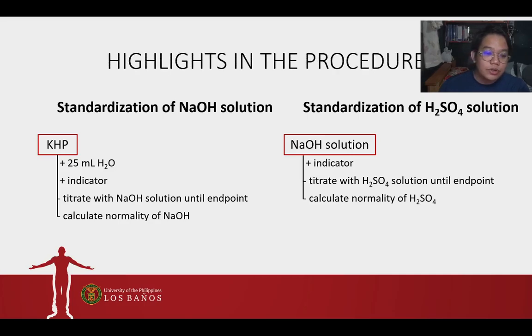So for the procedure, first we have to standardize our sodium hydroxide solution by using potassium acid phthalate as primary standard. Okay? So medyo alam nyo naman na tong steps na to from your Chem 32.1, no? Yung ating standardization of NaOH. So, yung ating standardization should include data na by means of weighing by difference, yung pagkuha ng mass ng ating primary standard. Okay? Next is, after we have standardized our NaOH, we will standardize our sulfuric acid solution using our NaOH. Okay?